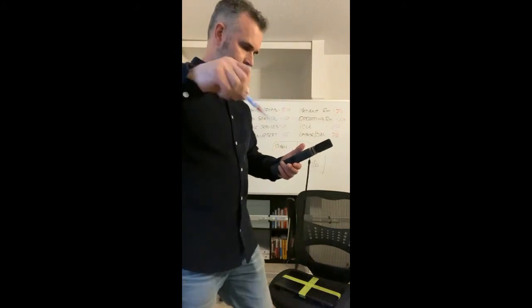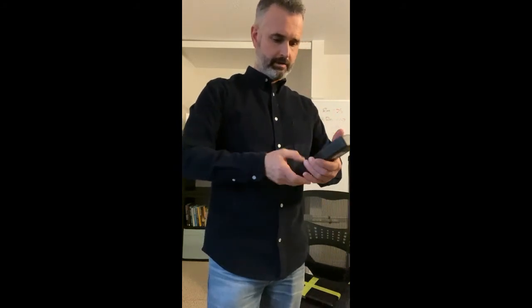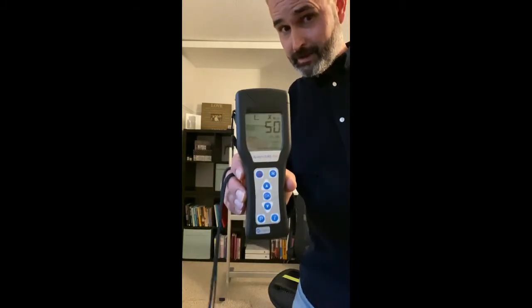All right. So let's see what we get on clean only. So in terms of, we talk about cleaning, sanitizing, disinfecting. Sanitizing gets a little bit confusing because, here we go. So cleaning only, we're actually down to a 50.